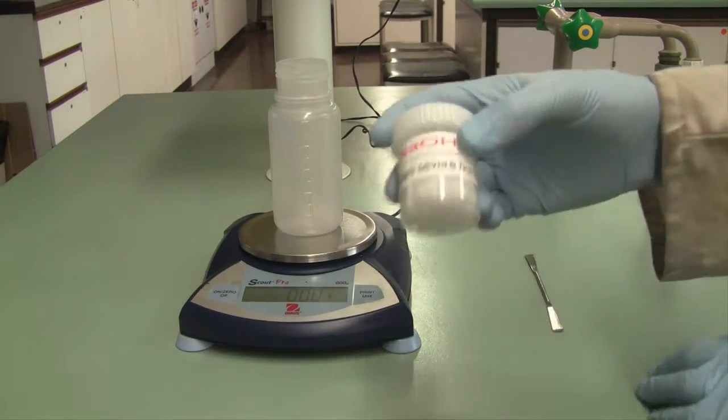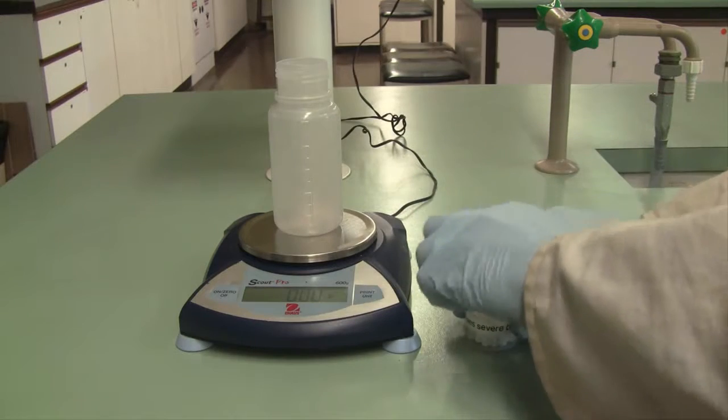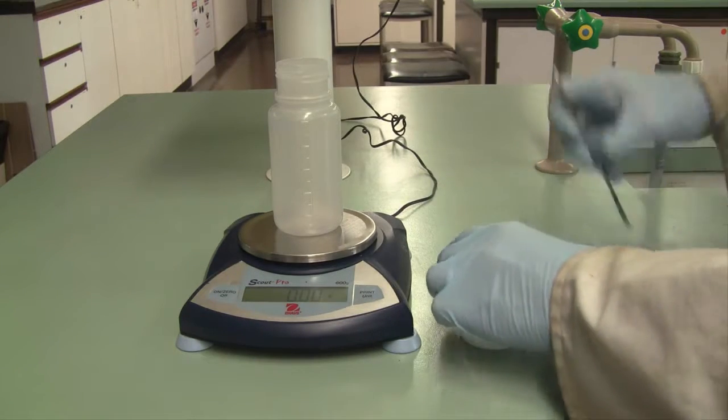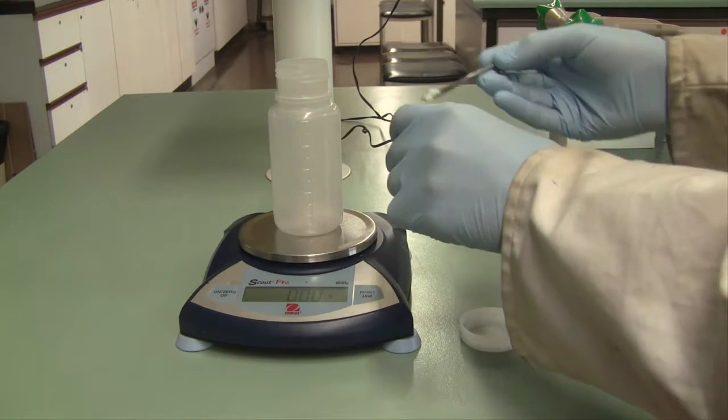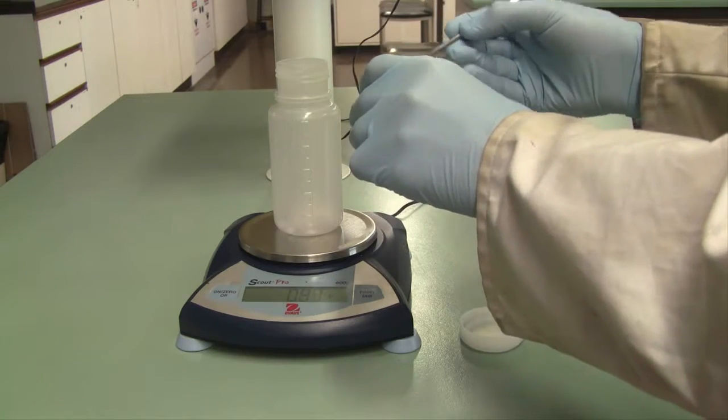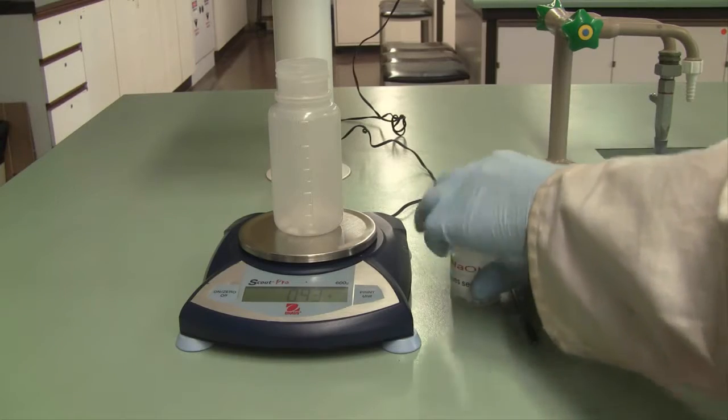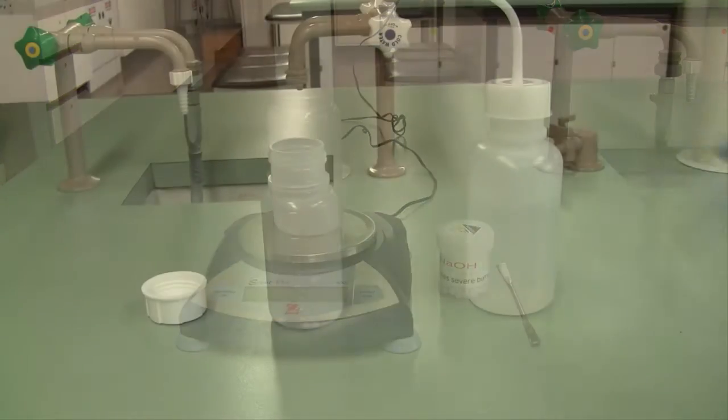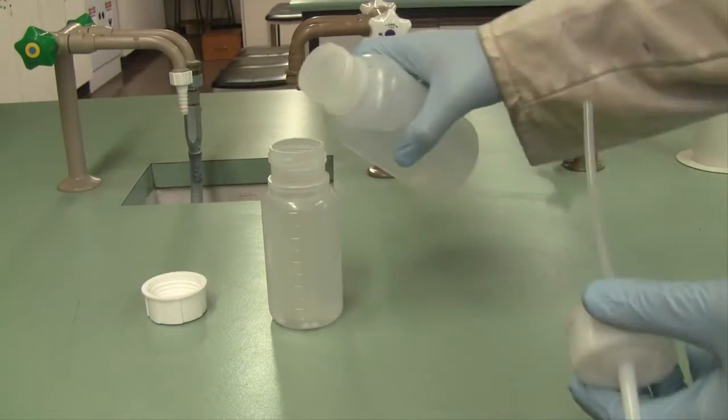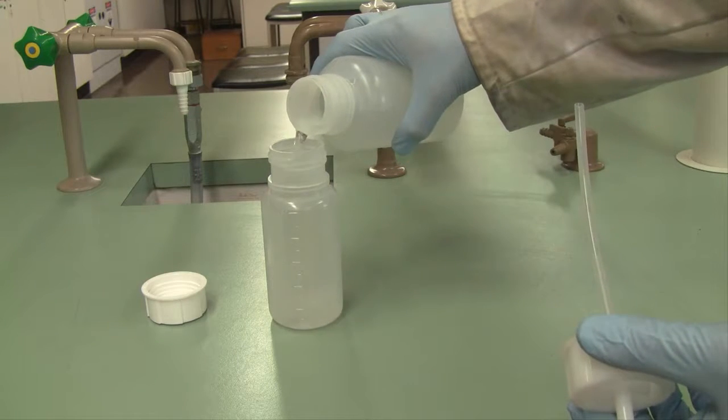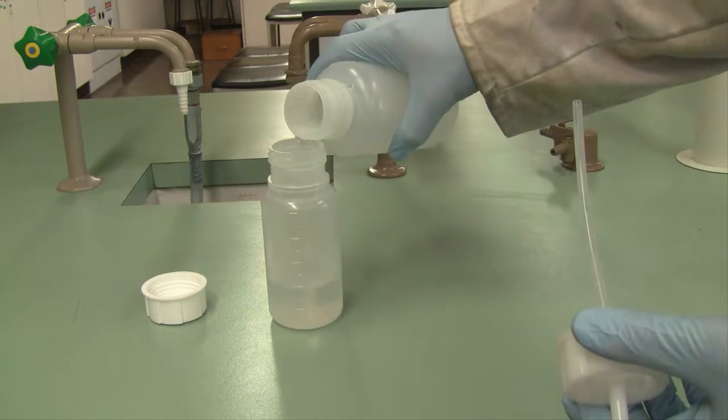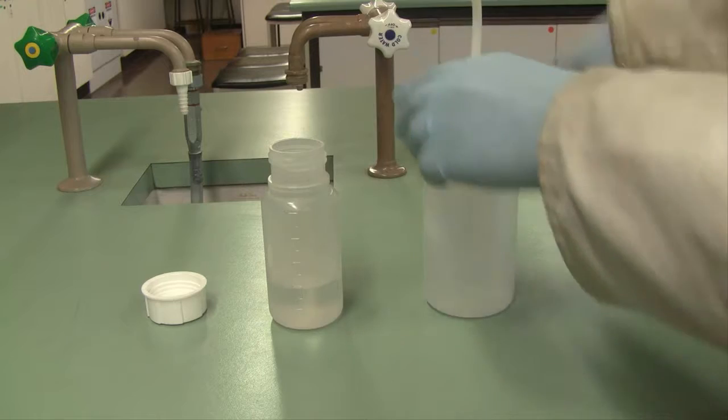We begin the experiment by preparing an approximately 0.1 molar sodium hydroxide solution. Please be aware that the sodium hydroxide pellets are corrosive, and you should handle them only wearing gloves. Weigh approximately one gram of the sodium hydroxide pellets into your plastic reagent bottle on a top loading balance. Then add approximately 100 mils of distilled water to the plastic reagent bottle. Then mix to dissolve the sodium hydroxide pellets.